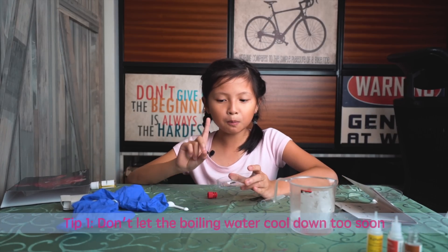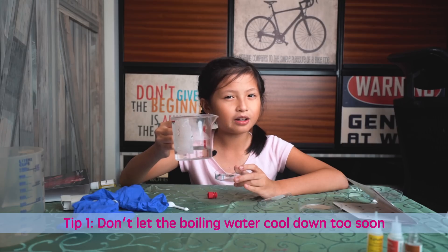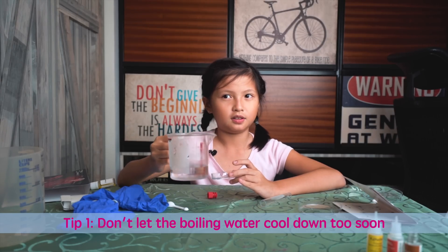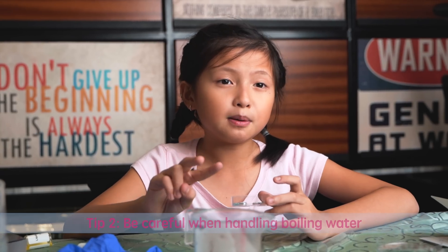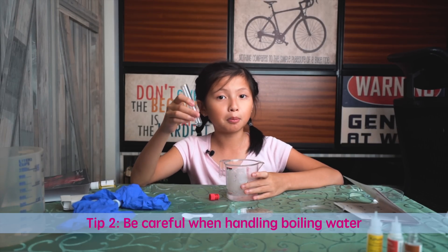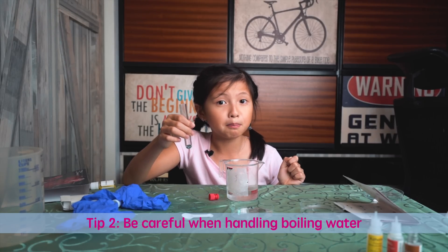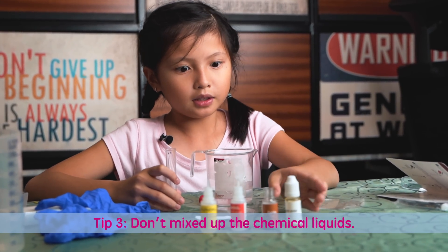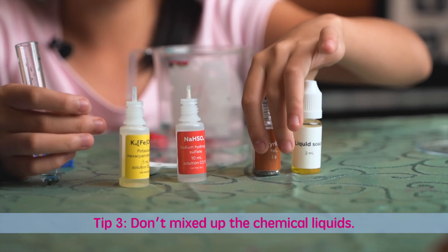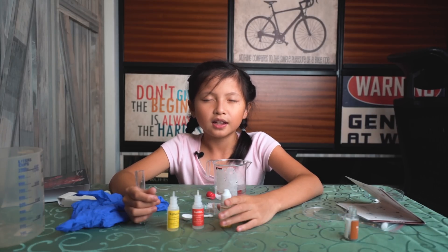I'm going to be telling you some tips. Tip one: when you have the boiling water, make sure you don't prepare the boiling water at the start of the experiment because it might become cold water and we don't want that. Tip two: be careful when you're pouring the boiling water into another cup or putting the test tube into the boiling water. Make sure you don't drop the test tube or your hands could get burned. Make sure you don't mix up the liquids — we only need three of these. If you switch the wrong liquids, it will become awfully wrong and there is no fool's gold, just a big fail.